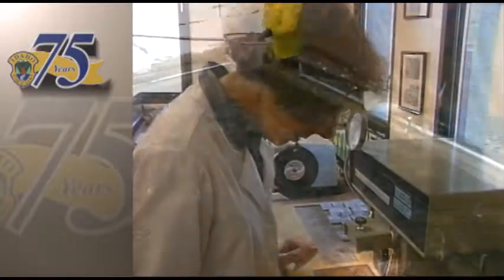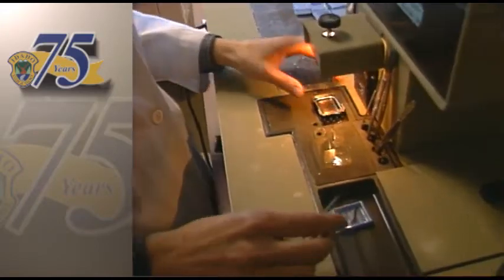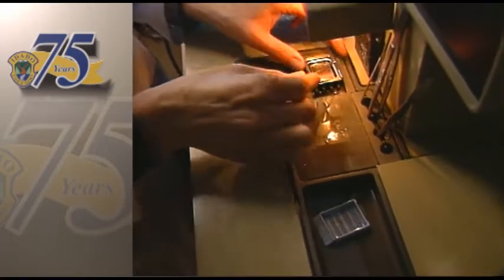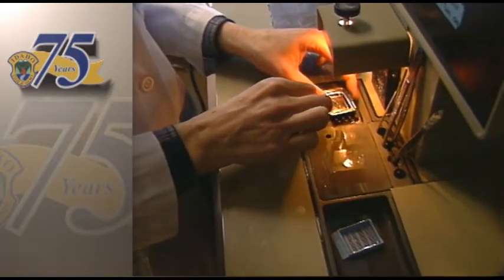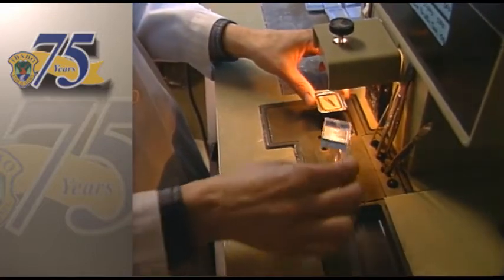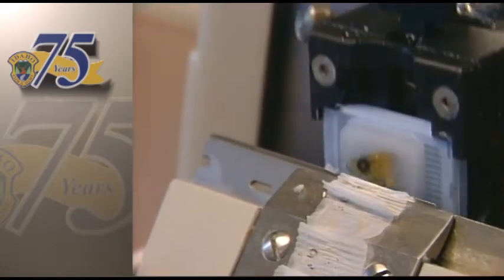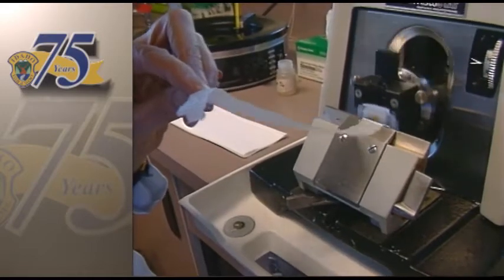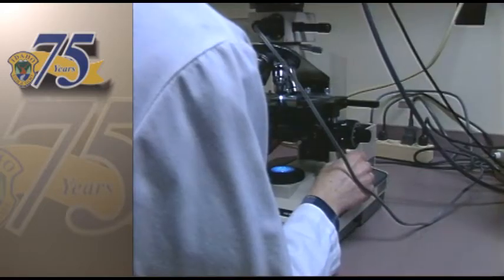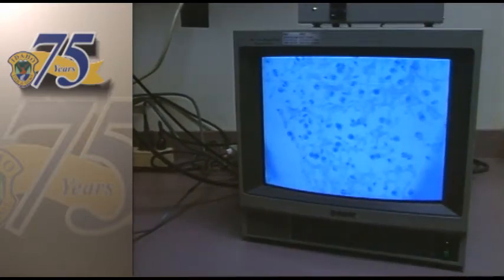These particular fish were having some problems swimming up, and they think that there's a fungus mat that's inhibiting them from getting their gulp of air to fill their little air bladders with. A section taken from the head of one of the affected fish is placed in a tiny container of melted wax. The wax basically just holds the tissue rigid so that we can cut it with a really sharp knife and get a real thin slice. And then we can make a slide and look at it under the microscope, and you can see a lot about the health or disease of the fish by looking at the individual tissues under the microscope.